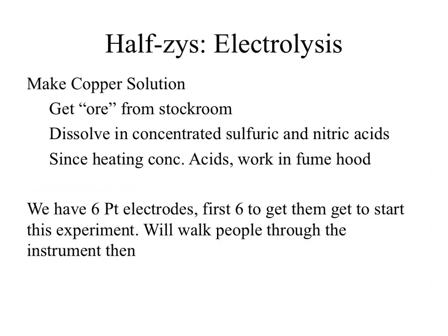At that point, we now have it into solution. So, and this would be for just the electrolysis portion at this point. Okay? So now what we could go through and do is kind of divide up. The organization on this is awful. I would recommend that everybody attempt to do the electrolysis first. The electrolysis is going to be our clutch point.